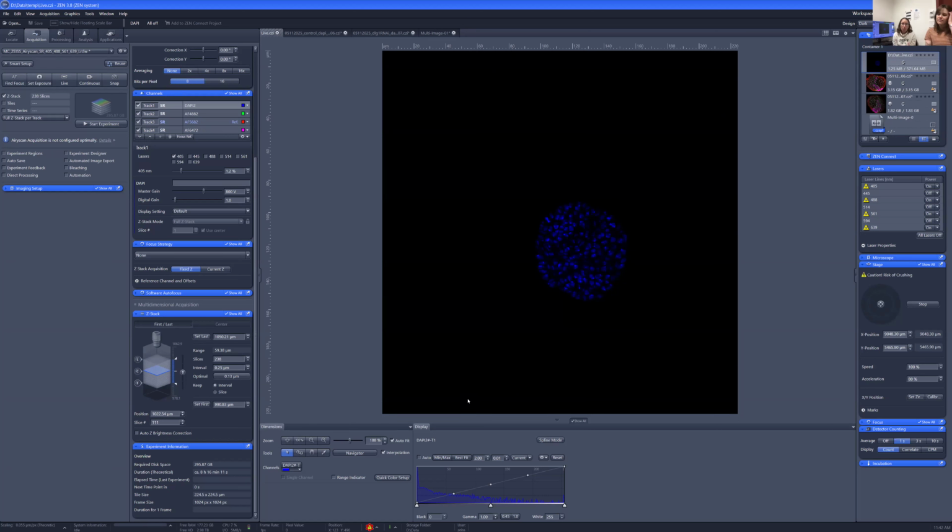So I'm going to go back to sharing my screen, but before I start operating the microscope and get a little bit distracted, are there any questions about the big picture goal of this experiment? Yeah, we got a question over here.